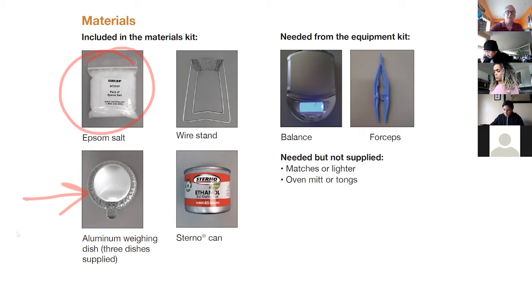And we're going to be heating them using sterno. Anyone who's been to a wedding reception or something will definitely have seen these things, under dishes, keeping them warm. Basically what sterno is, it's just a gel of ethanol. So when you burn ethanol, you don't really see much of a flame.